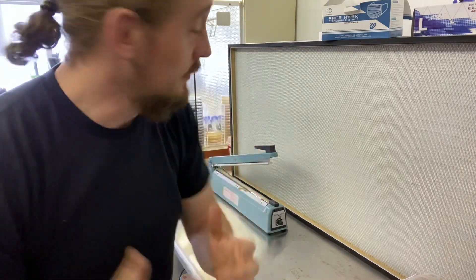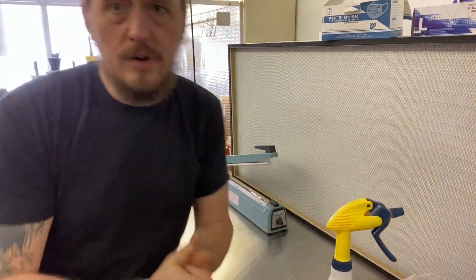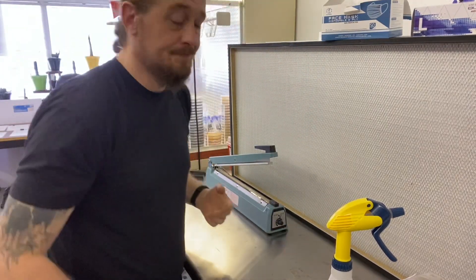So, the first thing I do is I come over here barehanded and I just mist some ISO over here — I'm clean, now I'm going to get to work. Guess what? I just brought the entire shop over to this flow hood.